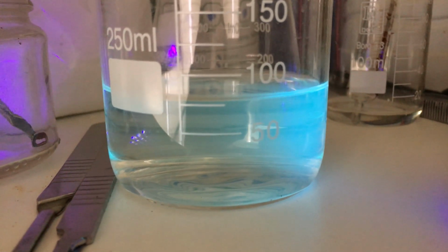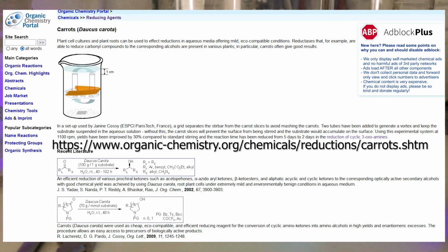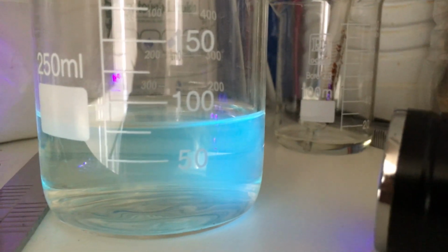So on a whim, I saw a paper on people using carrots as a reducing agent for ketones, which I'm not entirely sure what they are, but it's basically acetone. And the ketones were reduced to secondary alcohols using carrots. So I did a little more research.